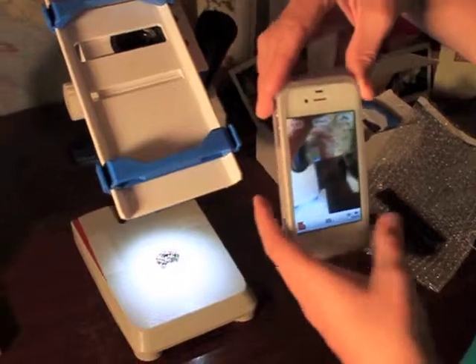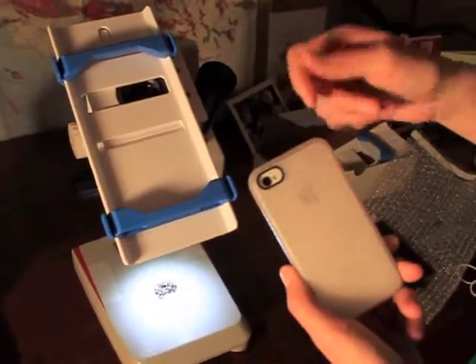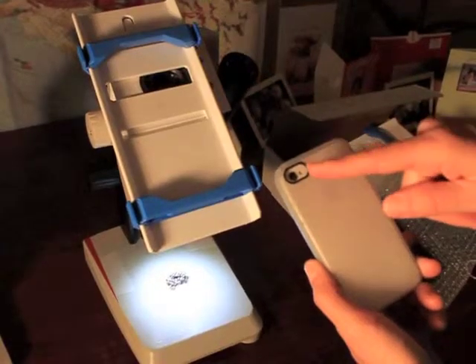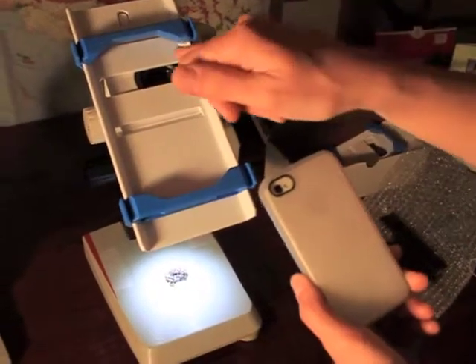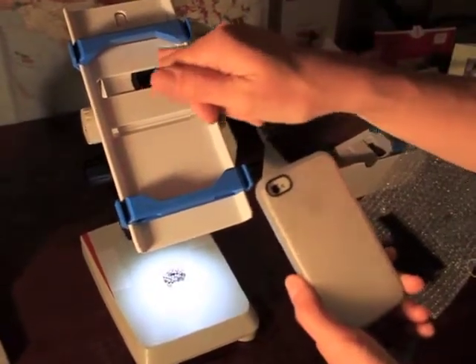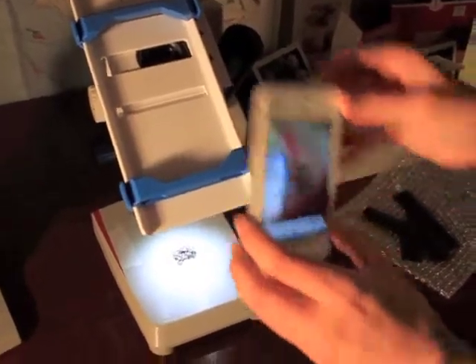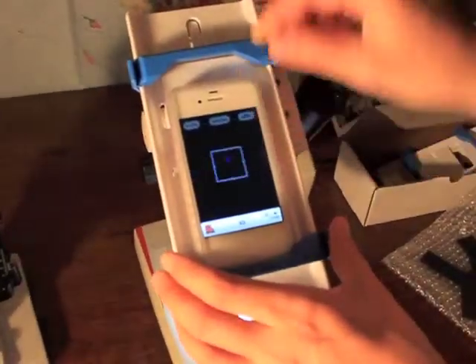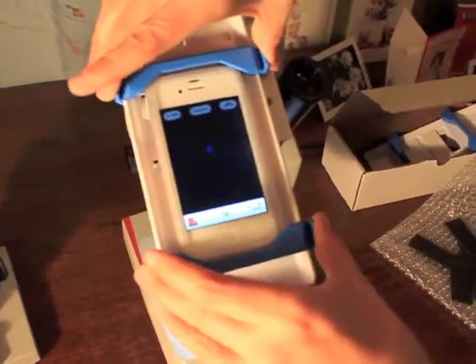Then you'll want to flip your phone over, check out where that camera is, because you want to line that camera up with the center of that eyepiece. Remember vaguely where it is, put it in here, slide the clips down so it's pretty solid.